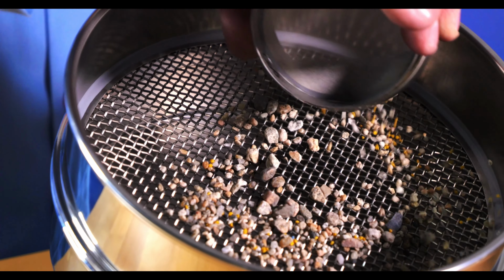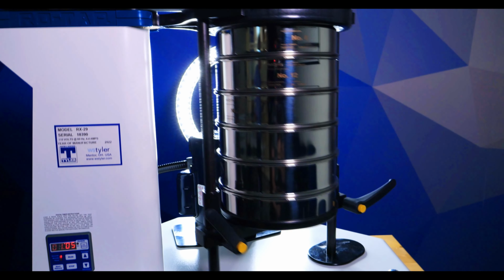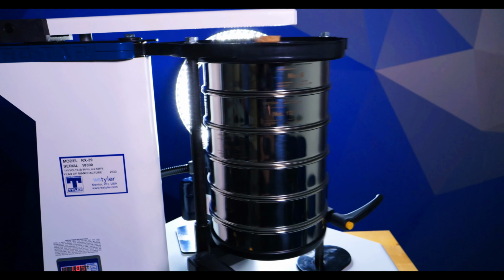A quick search on the ASTM website for sieve will yield 6,490 individual standard results. Each of these results provides information on which sieve sizes are required for a specific material. Each standard will detail how to perform the particle size test, including sample size, testing time, expected results, and acceptance method. ASTM International is one of the largest standards developing organizations in the world, creating standards for materials, products, systems, and services.